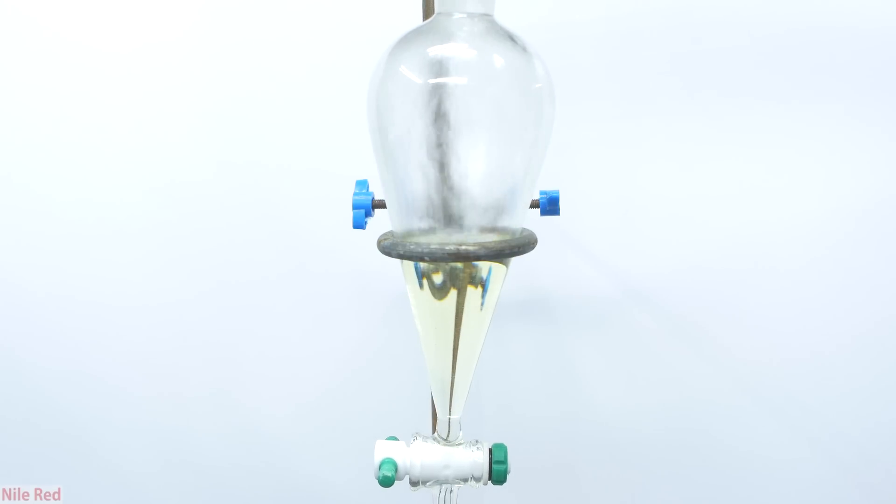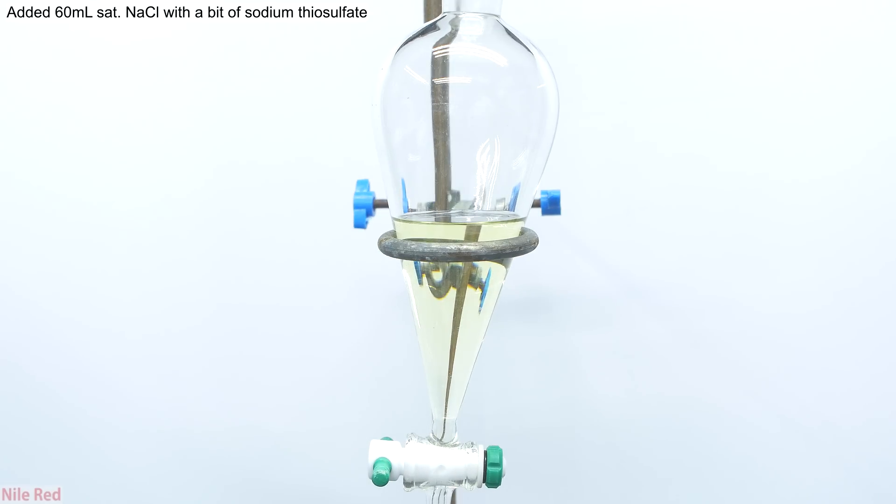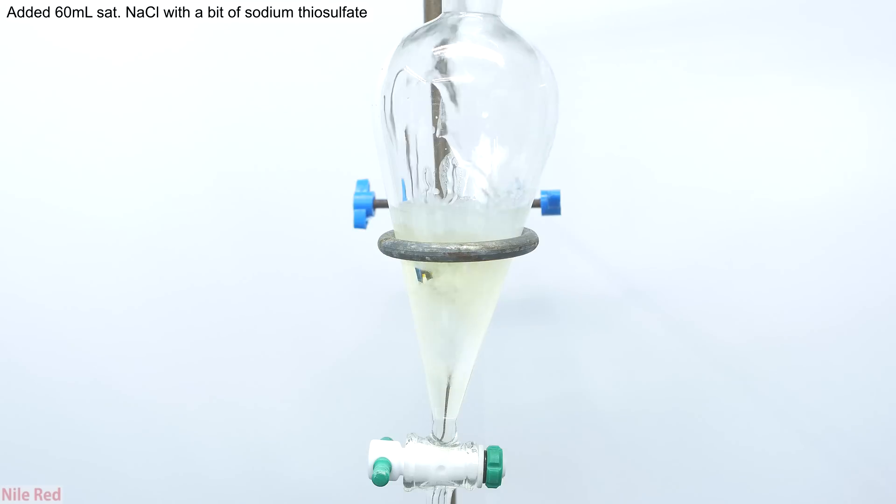This methyl iodide product that we collected is transferred to a separatory funnel. I then added about 60 milliliters of saturated sodium chloride solution which had a small crystal of sodium thiosulfate also dissolved into it. You can see that once it's added, the yellow color of the methyl iodide very quickly disappears. A little bit of iodine is giving it the yellow color, and the sodium thiosulfate reacts with it to form a colorless sodium iodide.